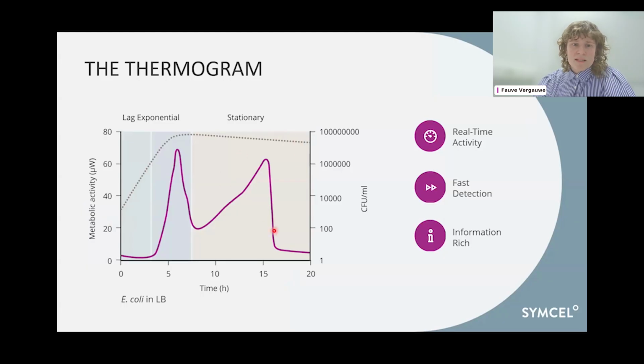However, when we look at the thermogram, this actually reveals that there's quite some ongoing metabolic activity. In this case, the first peak corresponds to aerobic growth, using all of the nutrients and the oxygen. But once the oxygen runs out here, there's actually a switch in metabolism where E. coli goes over into a fermentation state. So this is just an example to highlight how these thermograms can reveal very dynamic metabolic states that might otherwise be invisible with conventional growth measurements.